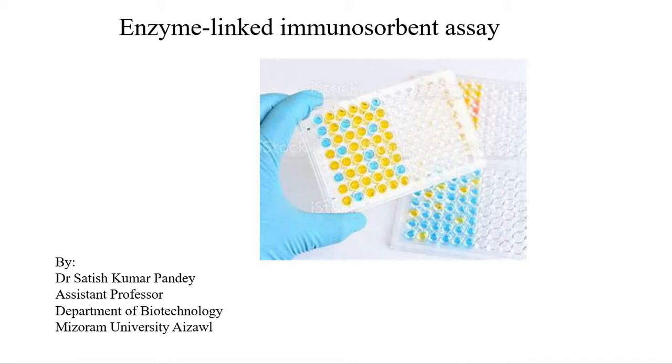I'm Satish Kumar Pandey, working as Assistant Professor in the Department of Biotechnology, Mizoram University, Aizawl. Today I'm going to discuss the ELISA technique. ELISA is an immunological technique and detects antibody or antigen present in the blood or serum sample of the patient.